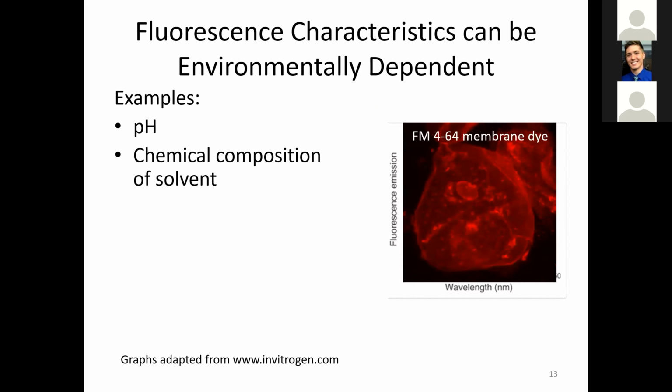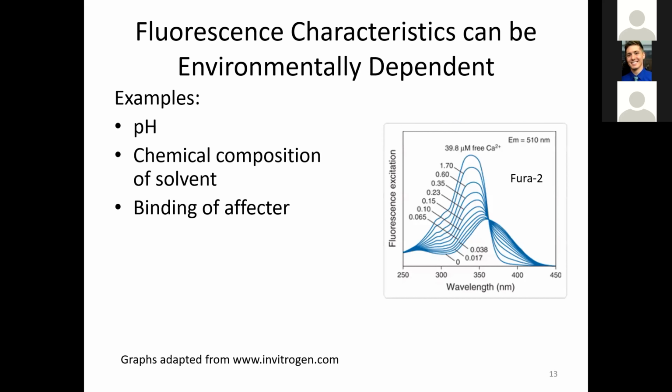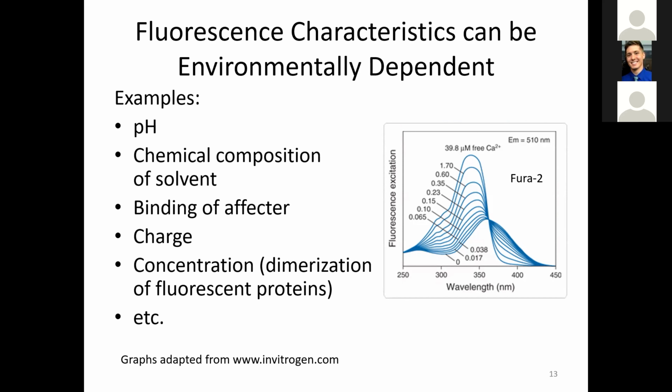The chemical composition of the solvents can also have an effect. So can the binding of the effector, how well it binds to your protein of interest, and also whether or not it's a calcium indicator or otherwise a voltage indicator. The charge and the concentration.